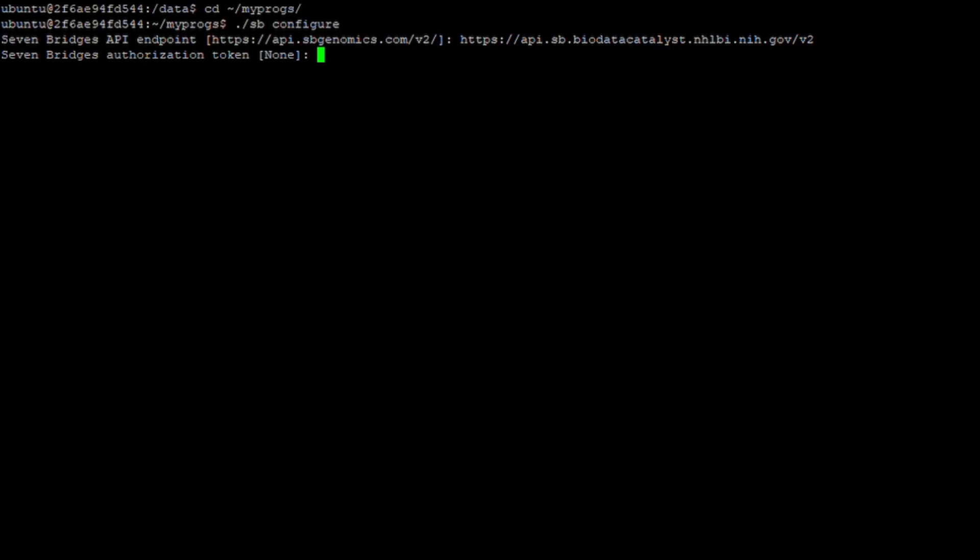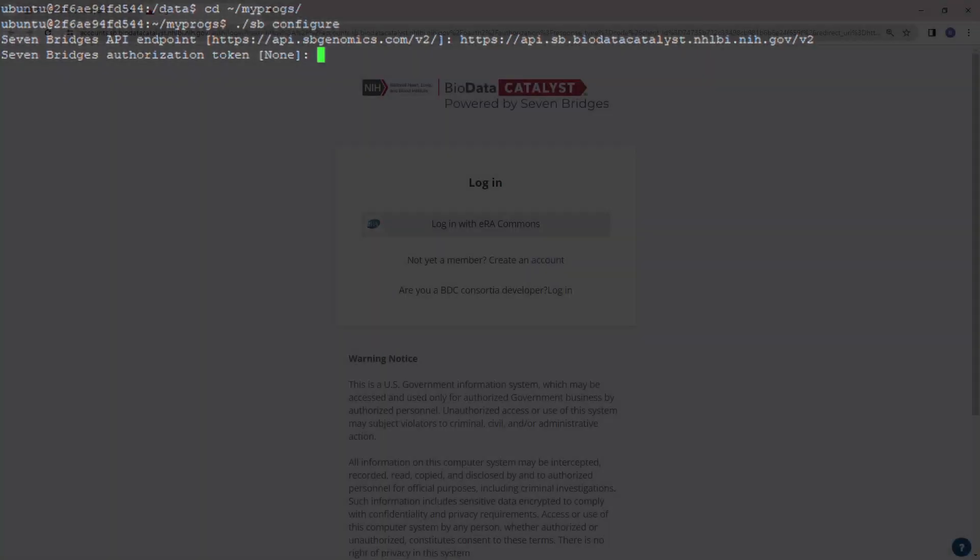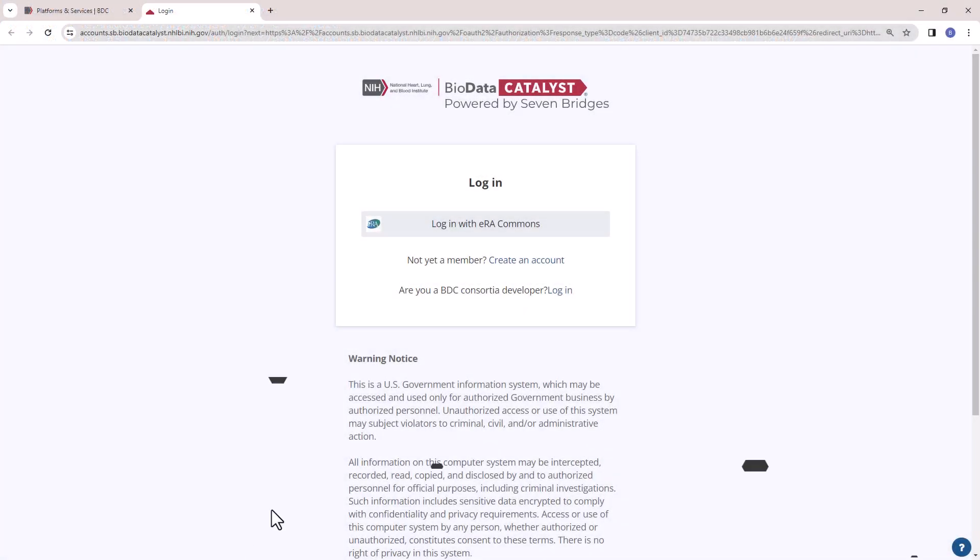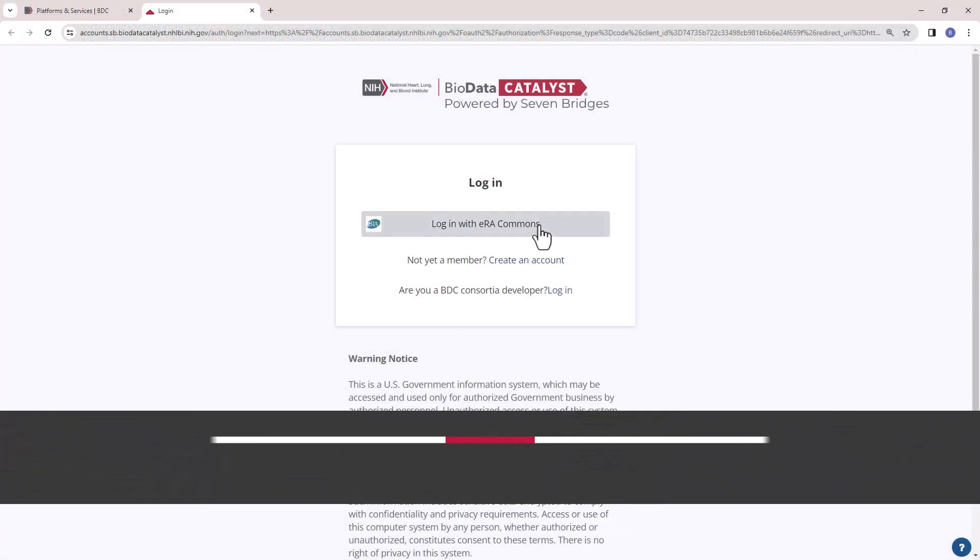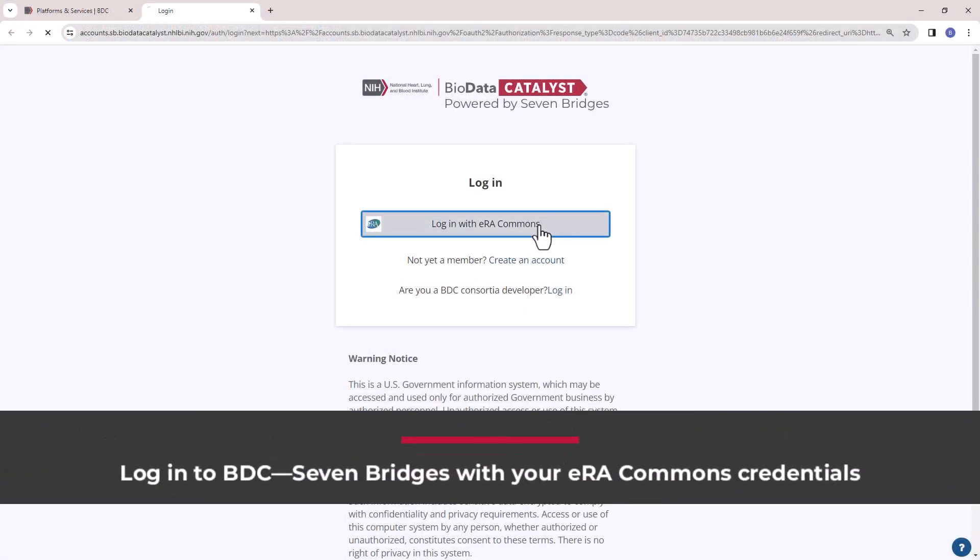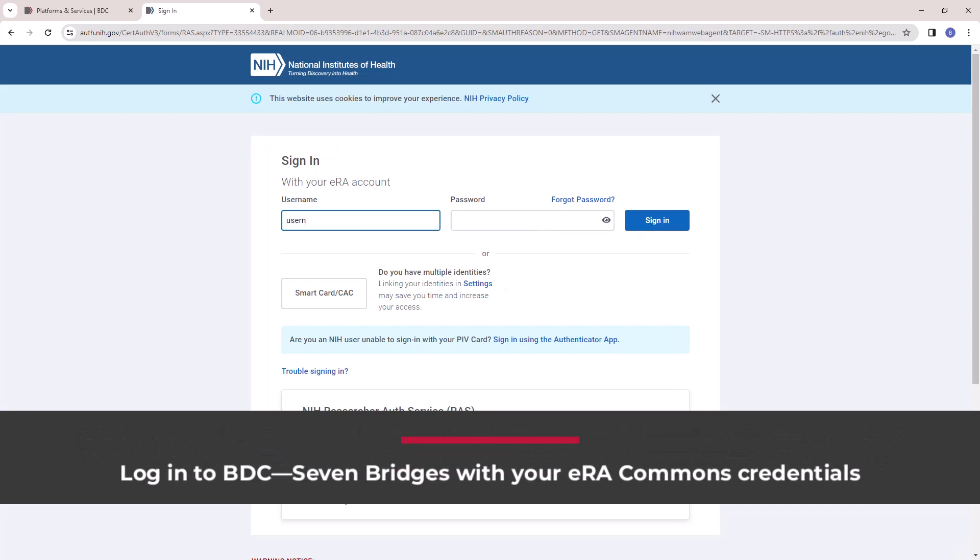A second prompt will appear requesting your Seven Bridges authorization token. This account-specific token uniquely identifies you and provides your encoded account credentials to the CLI client for use when issuing commands. You can find your account-specific authentication token by logging in to the BDC Seven Bridges web interface.